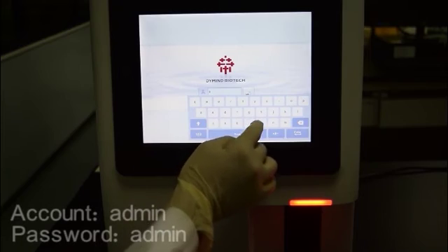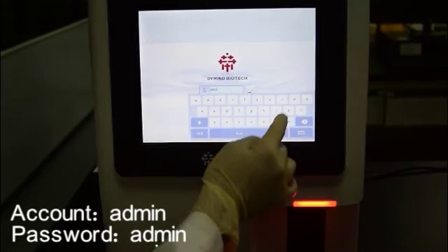And log in with admin account. Password is admin also.